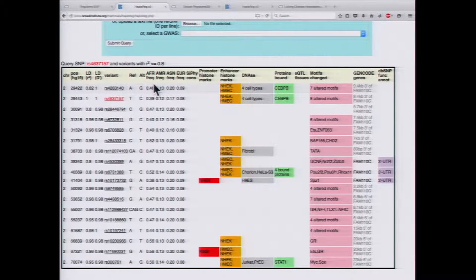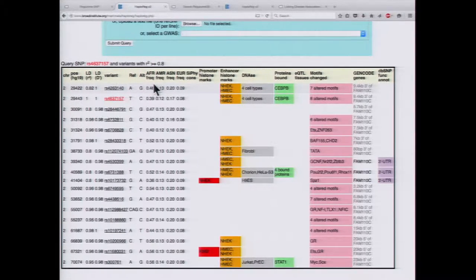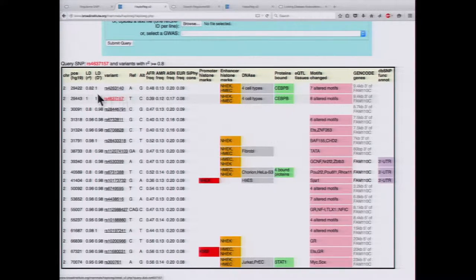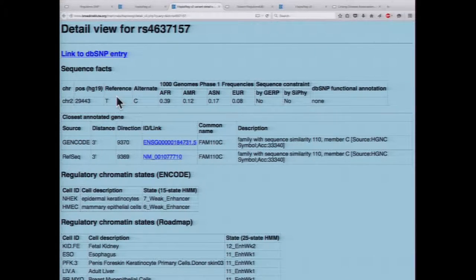It's nice — if you have a tag SNP and you're not sure if it's causal, you can see if there are other SNPs that may be causal in LD with your tag SNP. For more information you can click on the SNP itself; this overview is just a summary, and clicking gives you a nice detailed view.